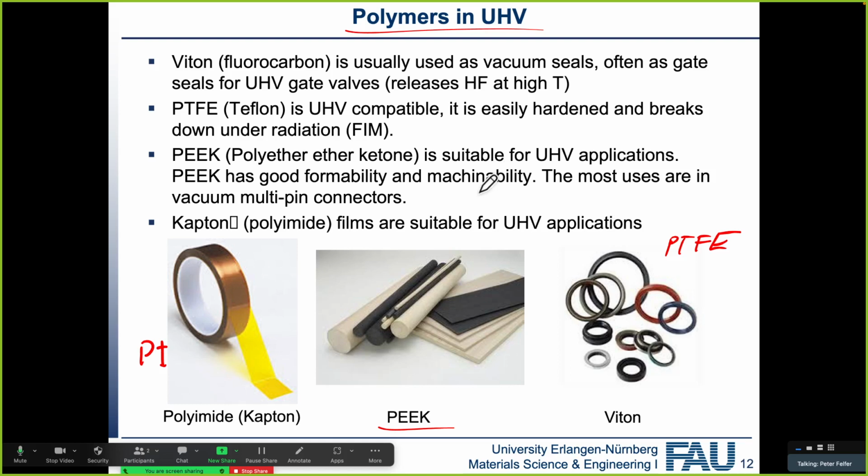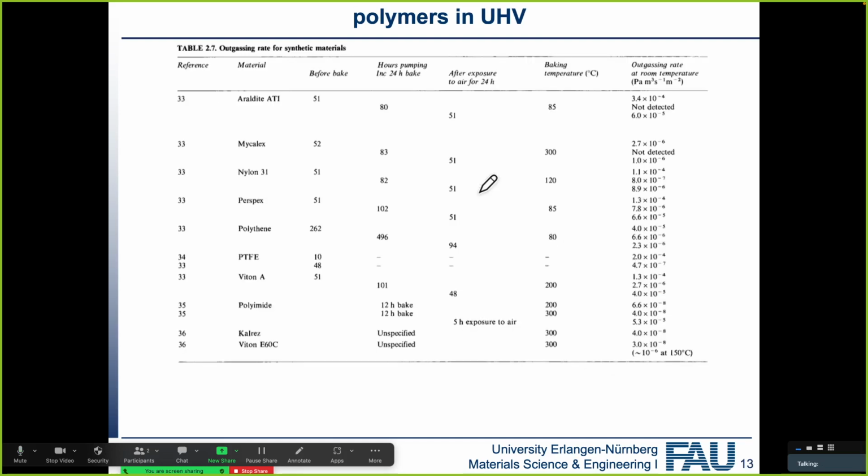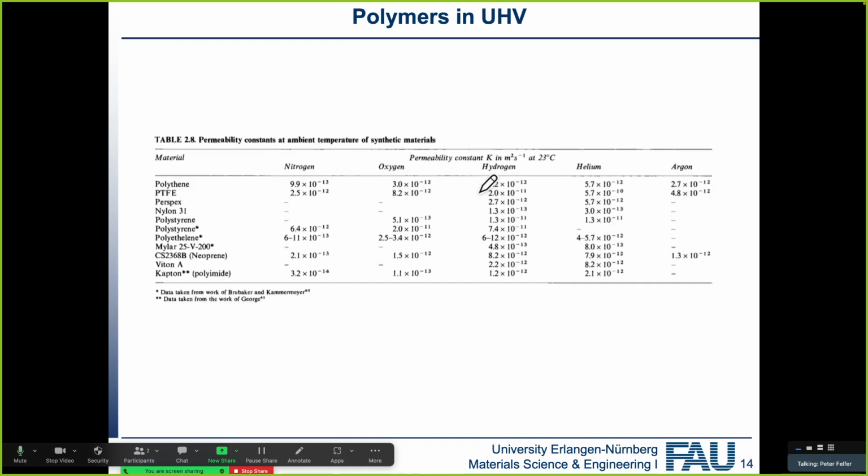So we've got little rods of polyimide downstairs about this size. They cost about €1,000 each, just the material. So if you see dark brown polymers lying around in the lab, put them where they're locked away, because we don't want to lose them. Okay, and I think we'll jump over that.